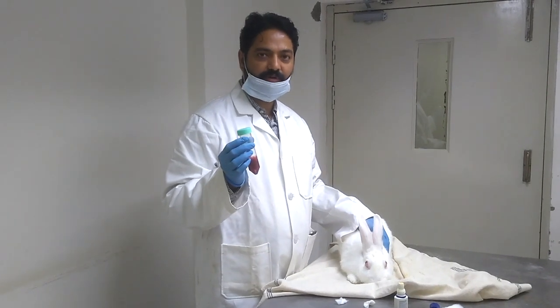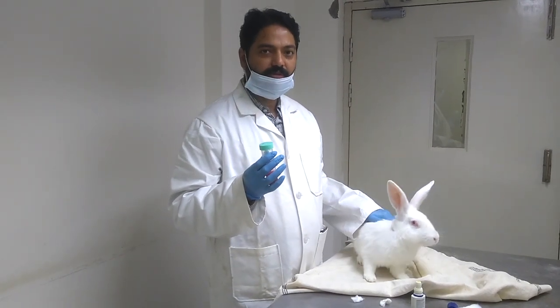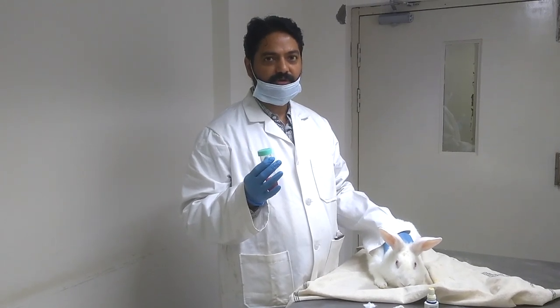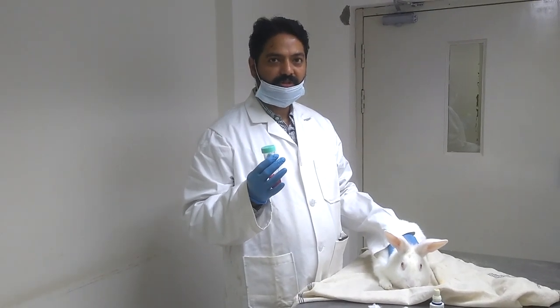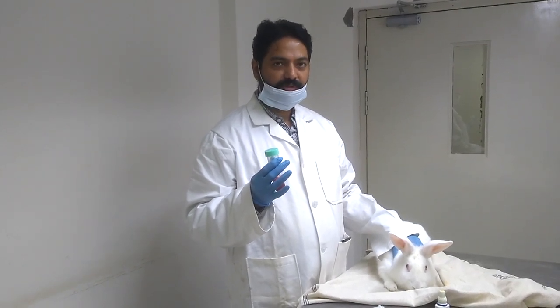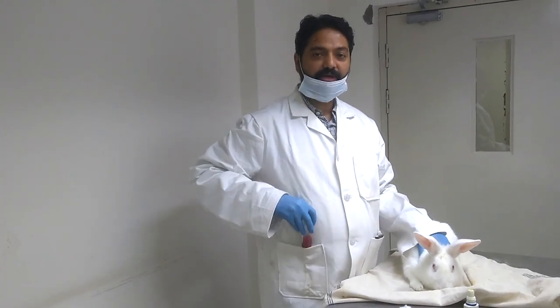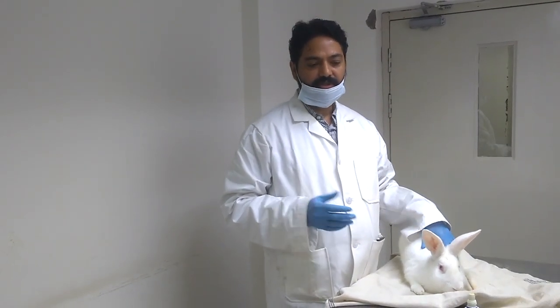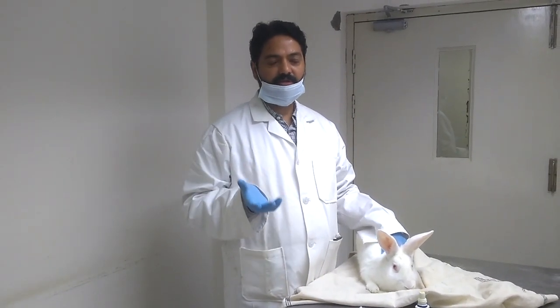We have isolated approximately 10 to 12 ml of blood. This will give us approximately half of that volume as serum. The blood will be coagulated at 37 degrees centigrade for 1 hour, and then kept at 4 degrees centigrade overnight, so that the clot shrinks properly and the serum is maximally taken out. And then isolate the serum. Add some preservative like sodium azide, and keep it at minus 20 or minus 80 as per the requirement, and then we also test simultaneously the titer and the specificity using the ELISA test and the Western blot test respectively.